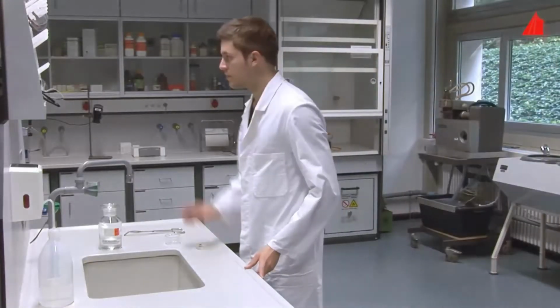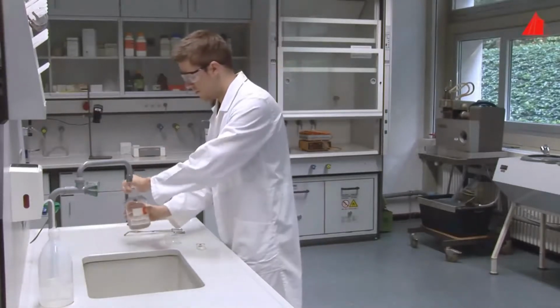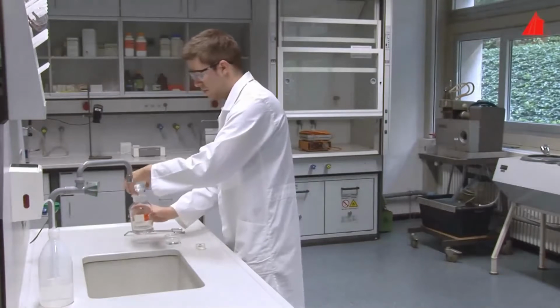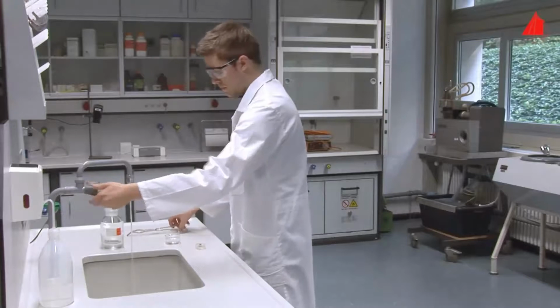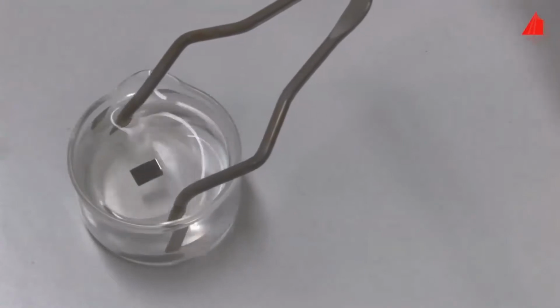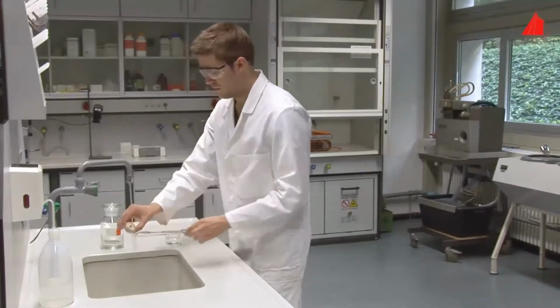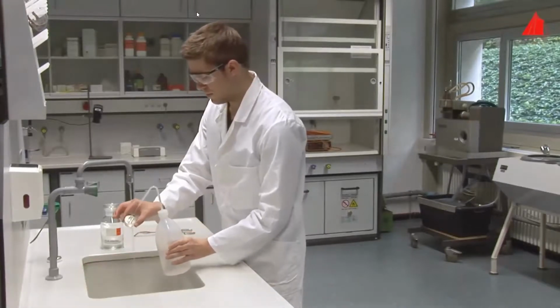To do this, our material tester protects himself with a lab coat, puts on safety glasses, and pours the etchant into a small glass bowl. The etchant consists of a solution of 10% of concentrated nitric acid in alcohol. Now he turns on the water tap, picks up the freshly polished microsection with gripping tongs and immerses it for a few seconds into the etchant. Then he rinses the microsection thoroughly with water and afterwards with alcohol. The hairdryer is again used for drying.